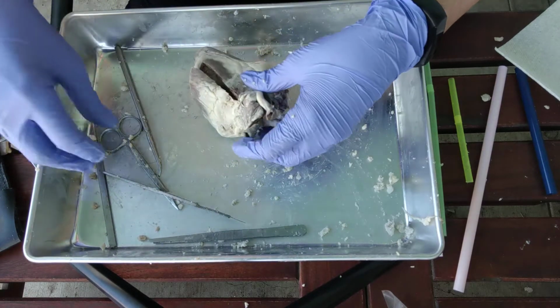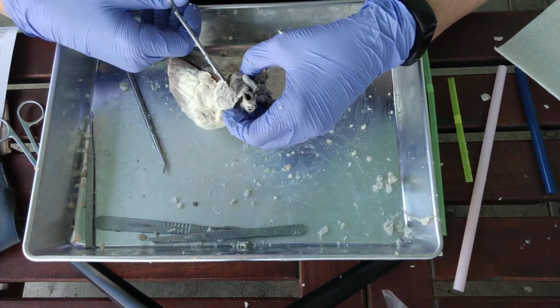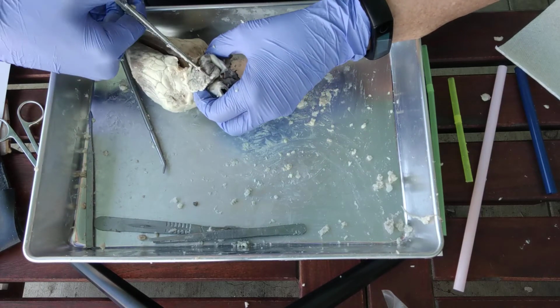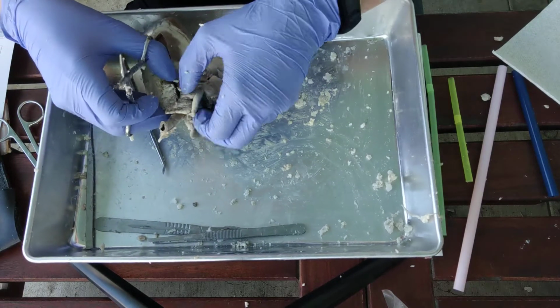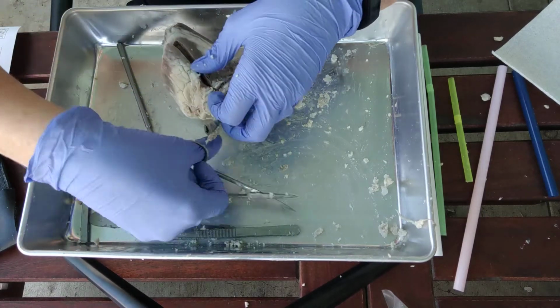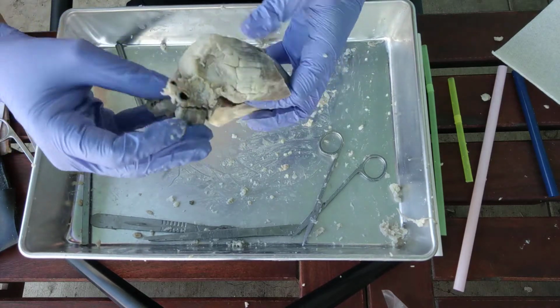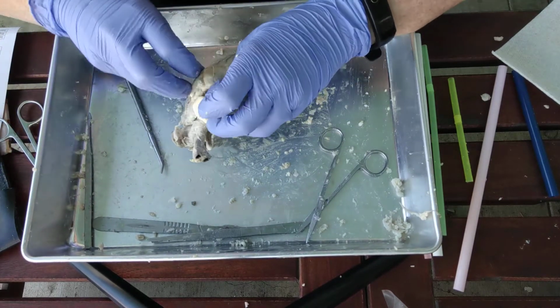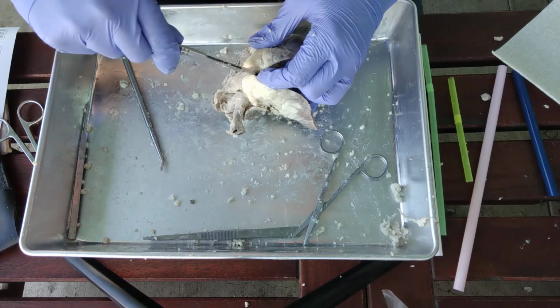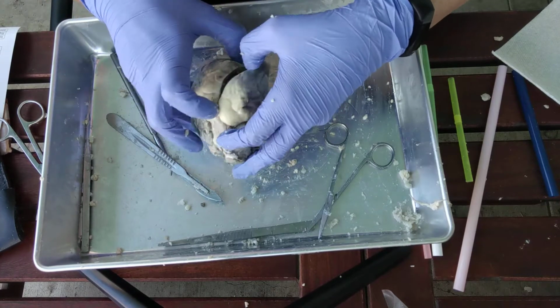Okay, so I'm actually going to switch back to my scissors, because the walls of the atria are much, much thinner than the walls of the ventricles, and so they'll be plenty easy to get through. Okay, so see what I did here? Now I have this wonderful window inside. Looks like I didn't go all the way through with that one.